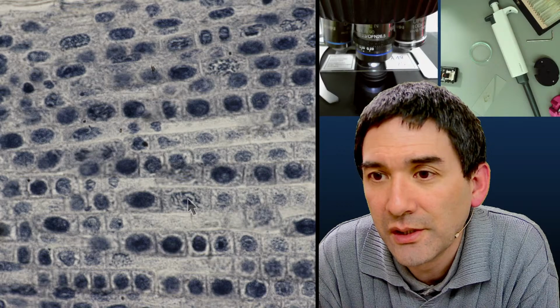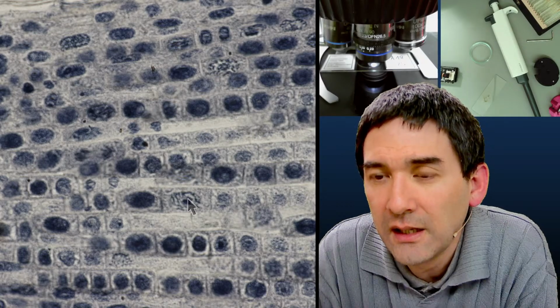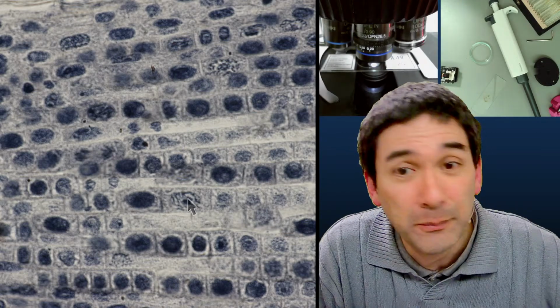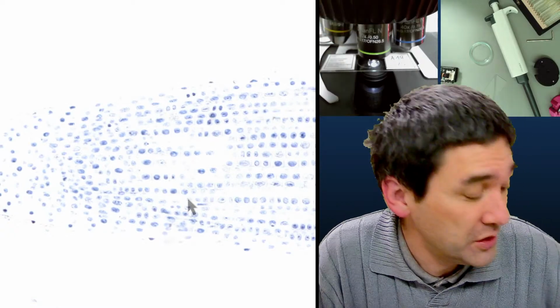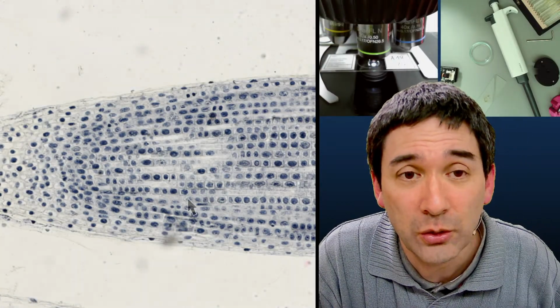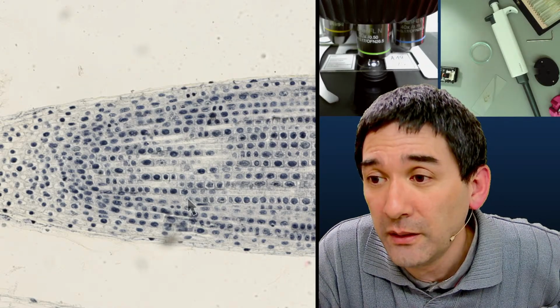Spirochetes are spiral-shaped bacteria, like Borrelia are, yes. I would generally be a little bit careful with spiral-shaped bacteria, because some of them can cause diseases. Okay. The amoeba is moving notably.